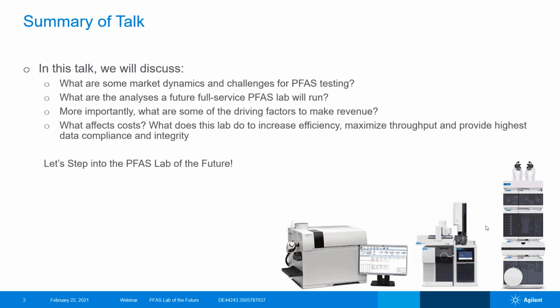So the summary of today's talk and just what we'll be talking about is we'll quickly discuss some of the market dynamics and challenges for PFAS testing. We'll also talk about when looking into the future, what will be the offerings from a full service PFAS lab? What are the methods they'll be running and how will they be doing this? More importantly, we'll discuss some of the driving factors on how these labs will actually optimize and efficiently run these PFAS samples so they can make maximum revenue.